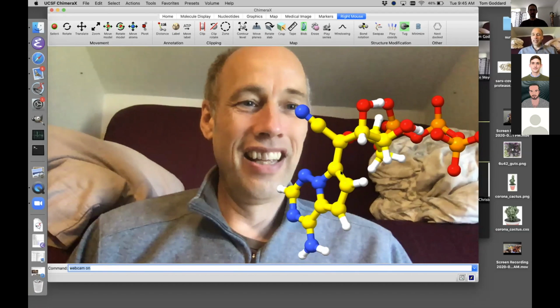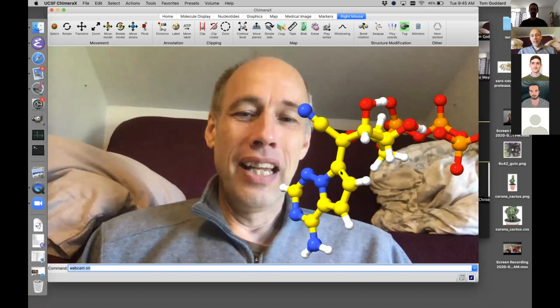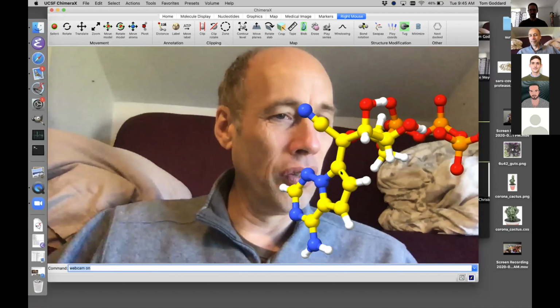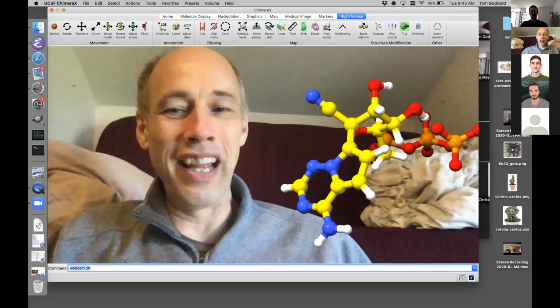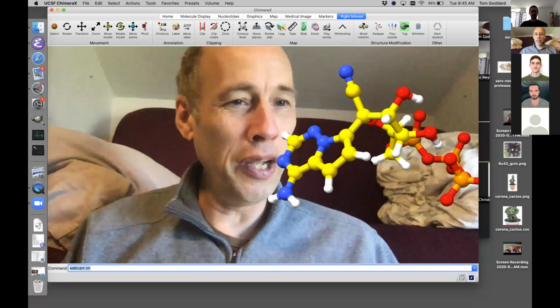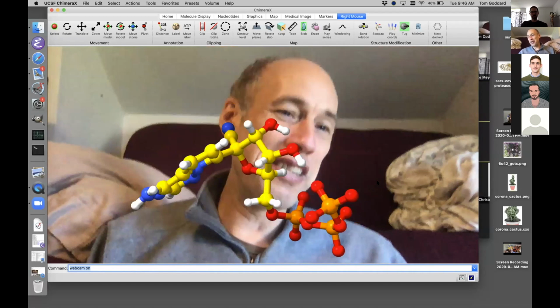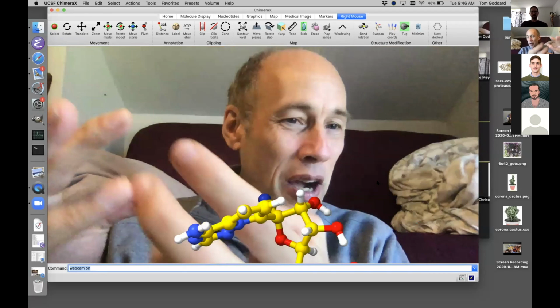One of the very fun things I find about virtual reality and this augmented reality now is there are so many surprises. You can't really predict until you try it. It's hard to predict the weird things that are going to come up. Like just your question here. Of course I tried it with the molecule not on top of my face. And I was totally shocked. I recorded a 1-minute video as a test, and I watched it. And I thought, this is horrible. This person is like a zombie. They're not even looking at what they're telling you. So that's why I had to do this. It's not a great solution, but maybe we'll get used to it in the future. If I was showing you something in front of my face, you might find it acceptable.